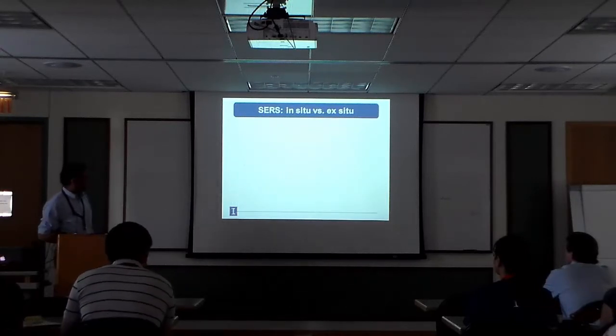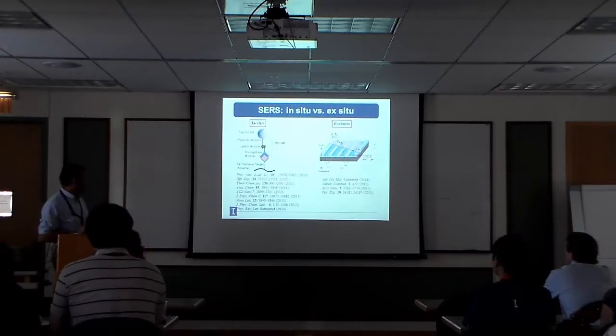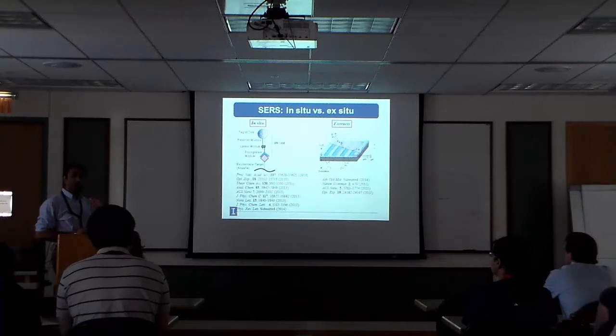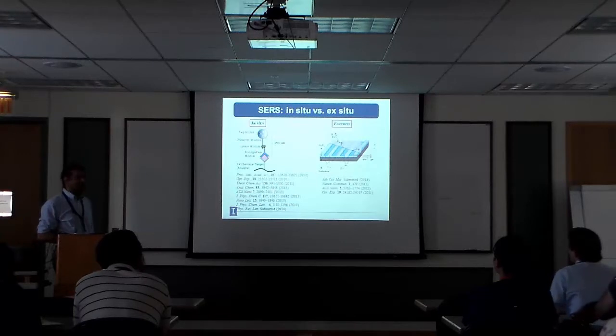I think I'm going to run out of time in another minute, so I'll point you to two other things in the lab. The first is, again, as I mentioned, we are very interested in trying to get more and more sensitive information because we would like to detect these 46 proteins in the blood at some point, right? So we have an intrinsic motivation to do that. And I think Brian Cunningham spoke about this as well. How do you make what he calls photonic crystals and put things on top of those? We have a somewhat more modest name. We call them surface enhanced Raman spectroscopy substrates.